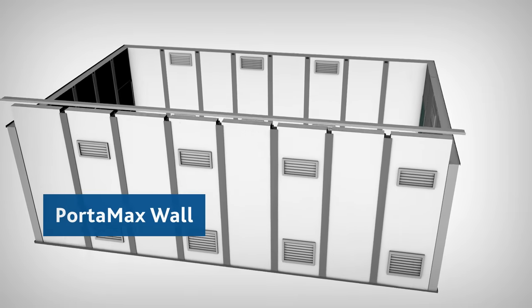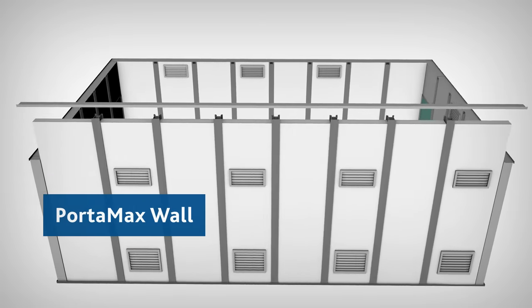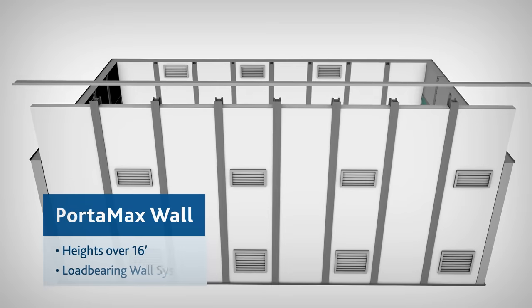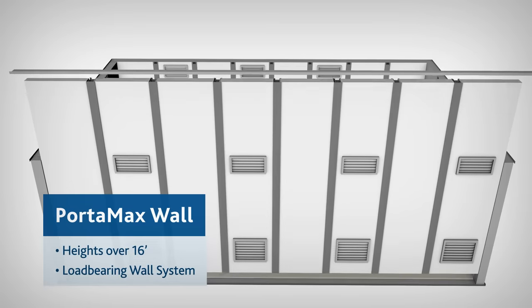Our Portamax wall system can be used for reaching heights over 16 feet or as a load-bearing wall system.